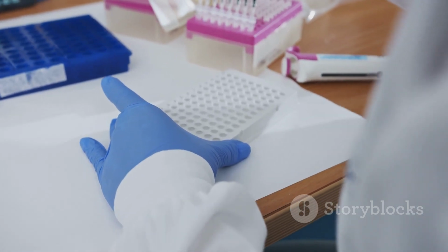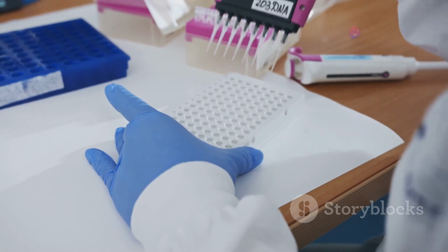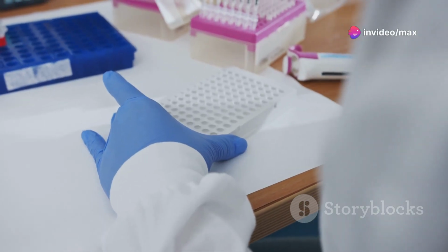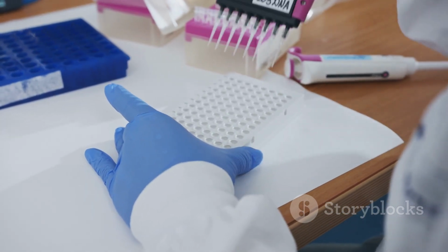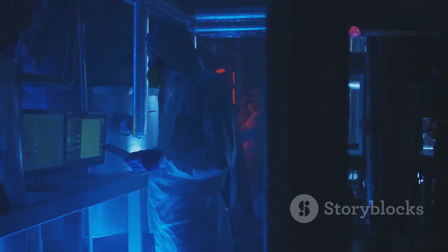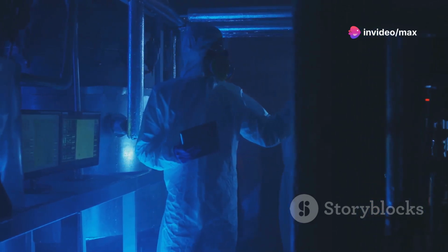Section 7. Competitive ELISA, a battle for antibody attention. Now, let's explore competitive ELISA, a technique where antigens battle it out for antibody binding sites. Imagine a game of musical chairs, but instead of chairs, we have antibodies, and the players are antigens.